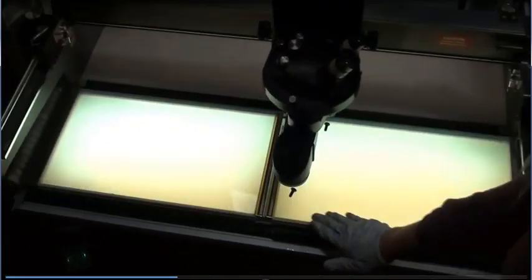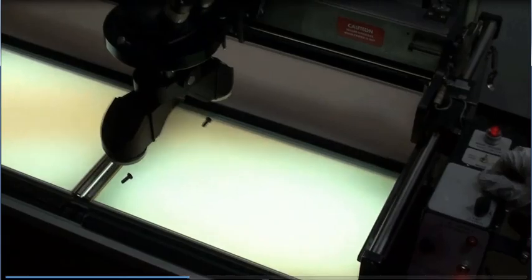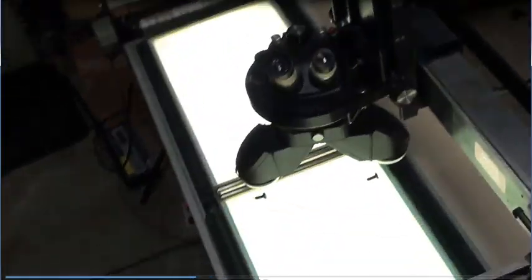Immediately you'll see that the light box does show up, and one cool feature that this has is you can change the intensity and you can also dim the lights. So I'm going to demonstrate that on high and then on low.